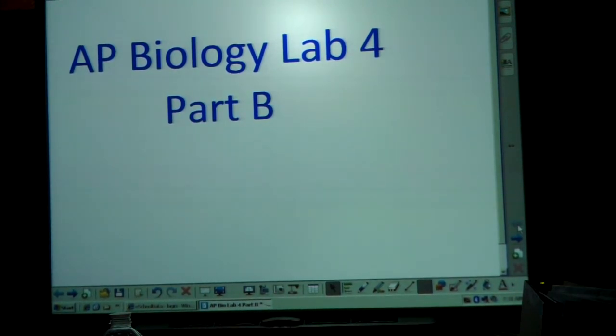Okay, so AP Biology Lab 4, Part B, where we're going to be taking a look at the photosynthesis light reaction. First thing you want to do, you want to make sure you turn your spectrophotometer on because that's going to take quite a bit of time to get warmed up.